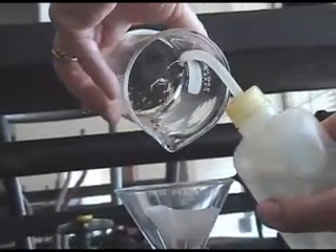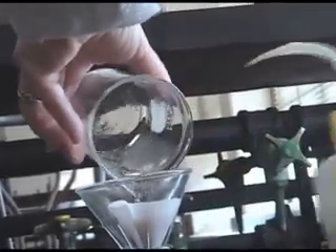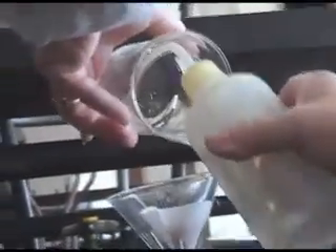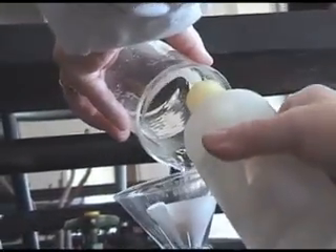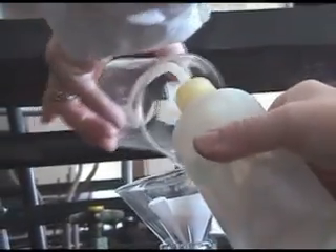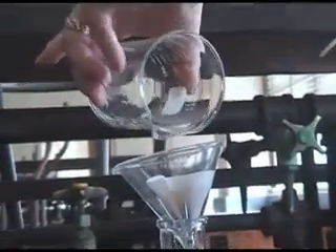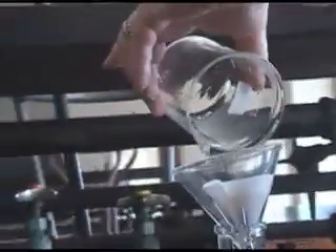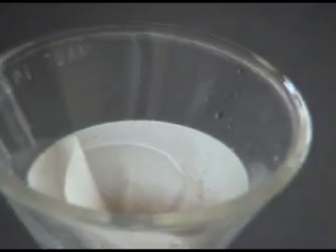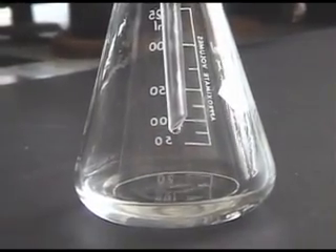Once the mixture has been filtered, rinse the container with solvent to make sure all of the solid has been transferred to the funnel. Rinse the solid collected in the filter paper with solvent. To ensure you have not lost any product, make sure the filtrate flowing out of the filter paper is clear.